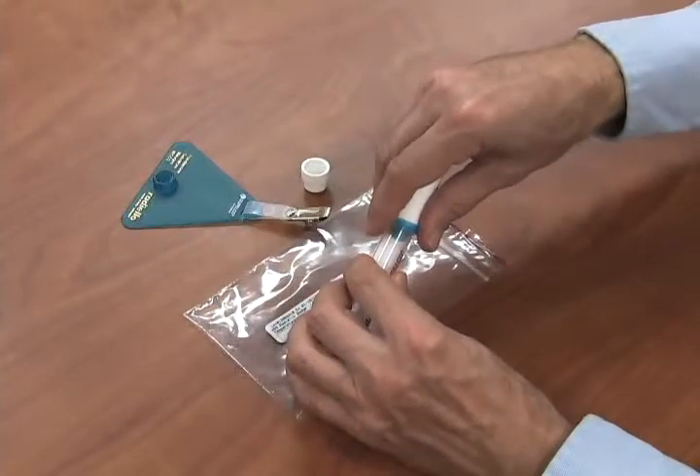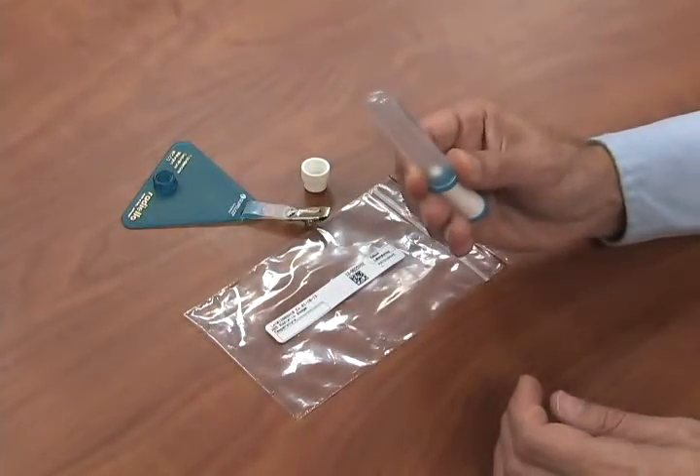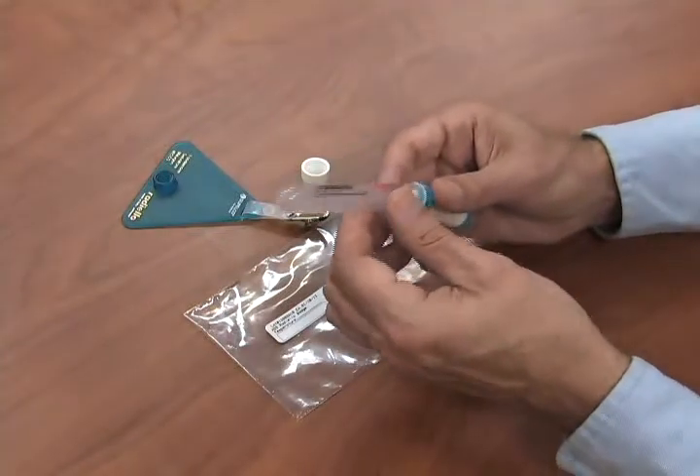Step 1. Draw the absorbent cartridge out from the tube without touching the cartridge with your hands, and insert it into the diffusive body.